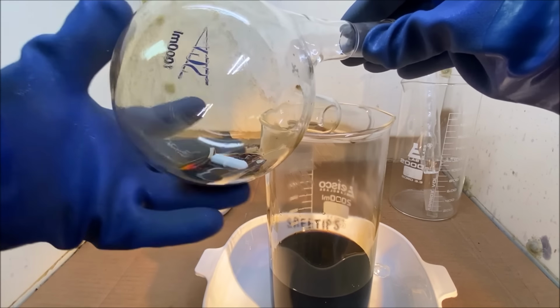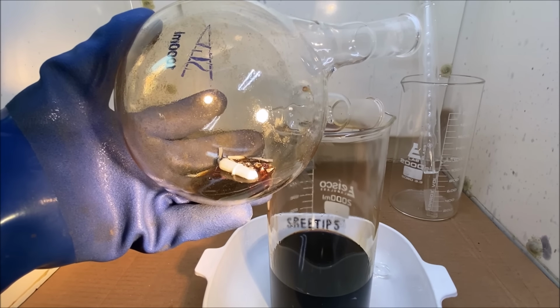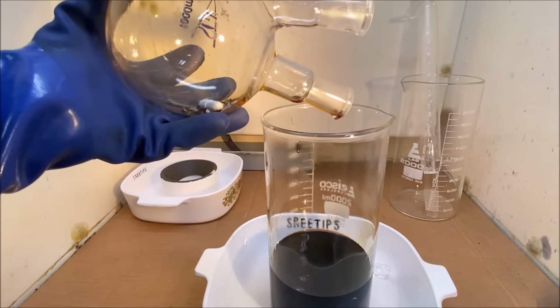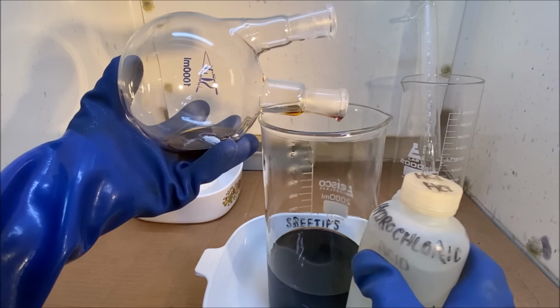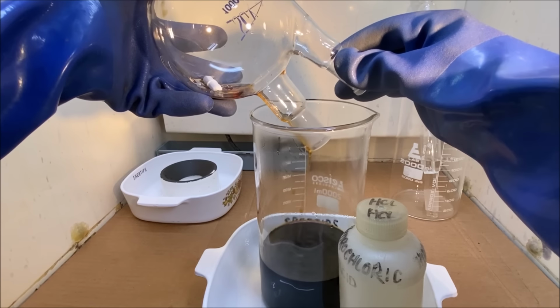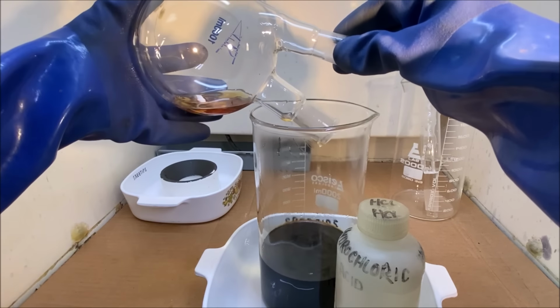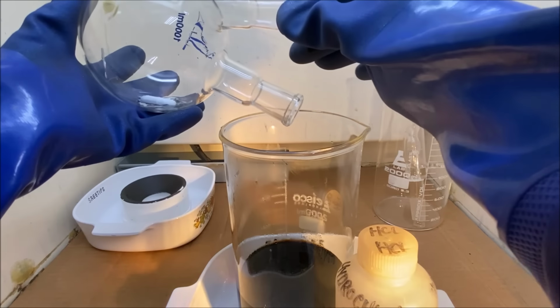Some solids left in there. I don't know if you can see that. Solid pieces of metal. So I'm gonna have to dump all this into this beaker.